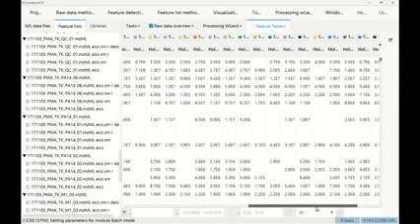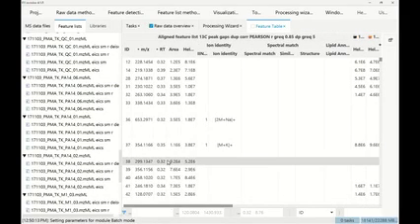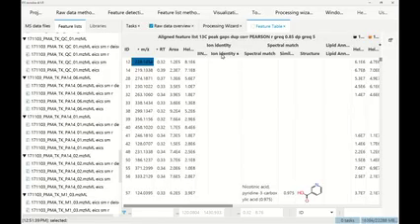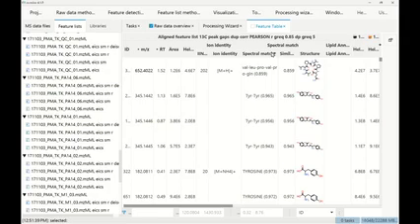For each sample, we found some features, and they have an MZ, retention time, height, and maybe MS2 spectra. Then on the row level, we also have the median MZ, retention time, and then also the ion identity here, for example. And because we applied spectral library matching, we also got, for example, a structure.